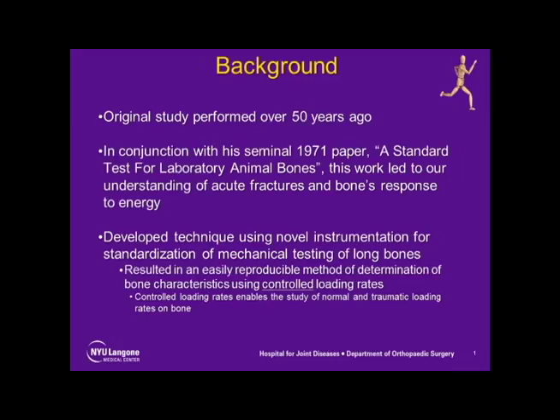This video is the digitized original reel-to-reel footage of Dr. Victor H. Frankel's groundbreaking experiments demonstrating the viscoelastic properties and failure mechanisms of loaded bone. The work, performed in Sweden in the early 1960s, was the basis for his PhD. Years later, as recognition for the sentinel work and his contributions to the field of orthopedics, Dr. Frankel was knighted by the King of Sweden.